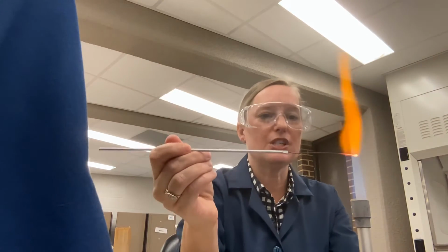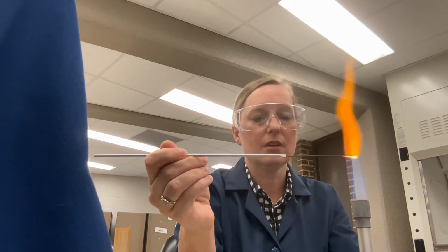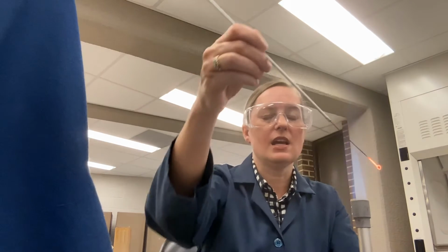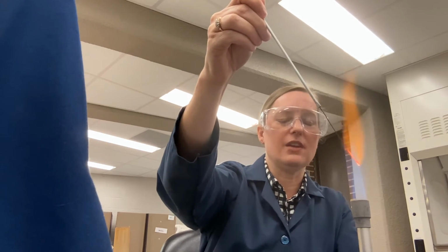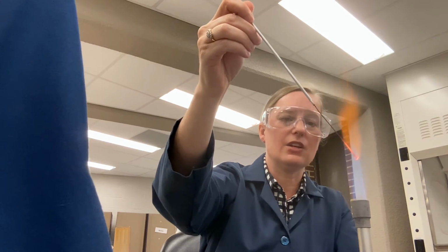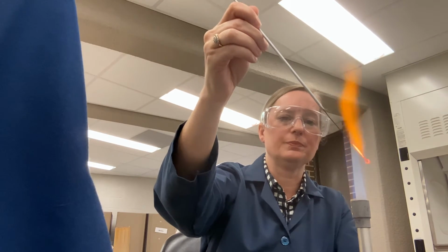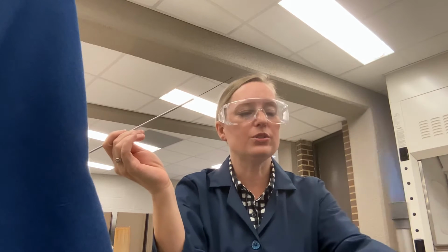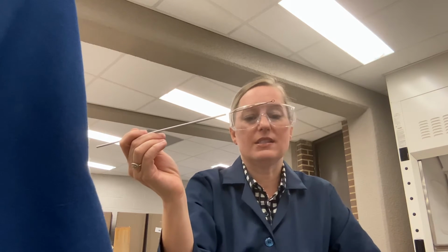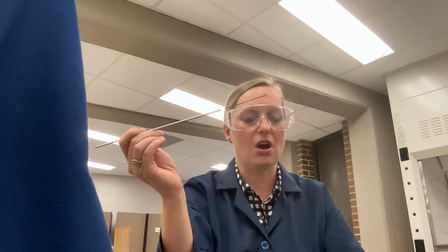And if you just were to do this, you would only get the tip contaminant free, and then we could potentially add contaminants at the end. So again, if you put it like a pencil, kind of dip it in, it's all nice and red hot, and that angry part of the flame, that blue cone. And you also want to make sure that we let the loop cool between the flaming and the plate. Otherwise, again, you hear the snake sound, which is going to be killing the bacteria that we want to grow, and we would damage the agar.